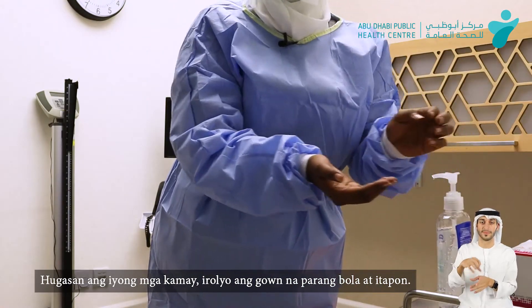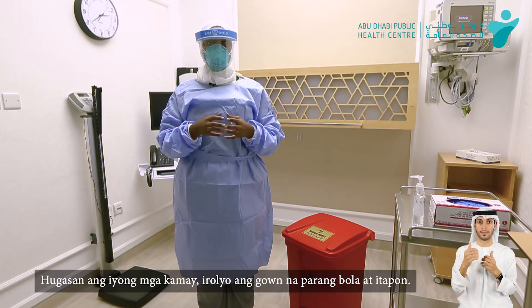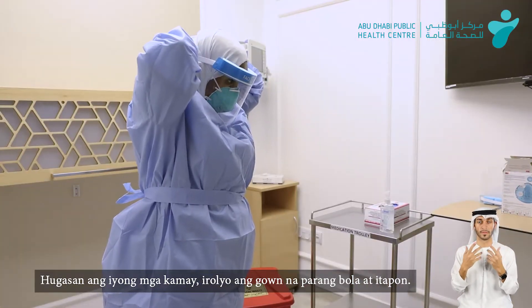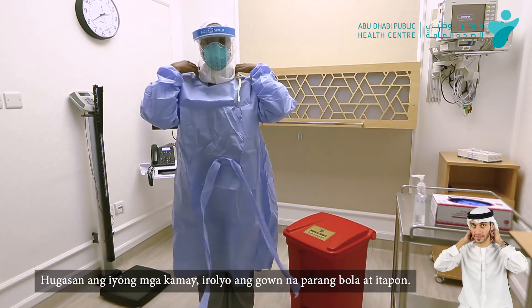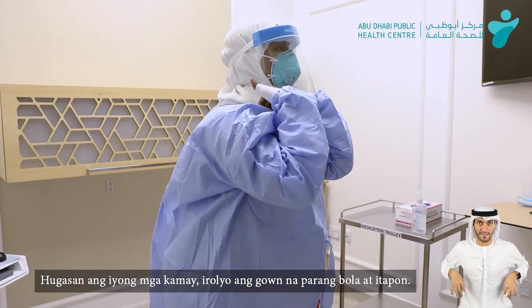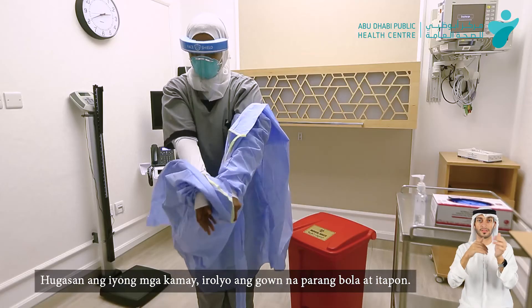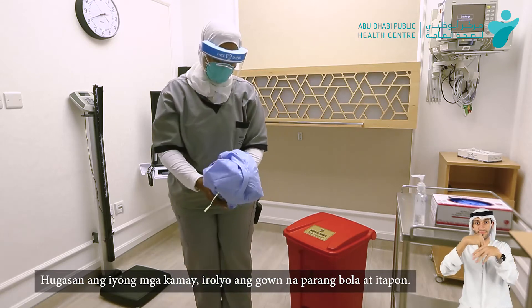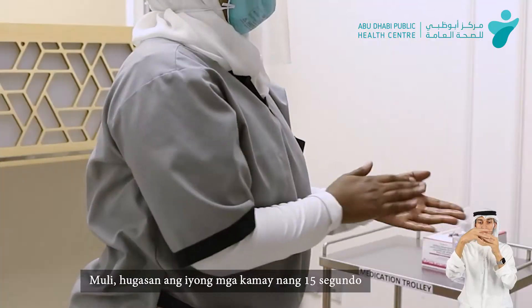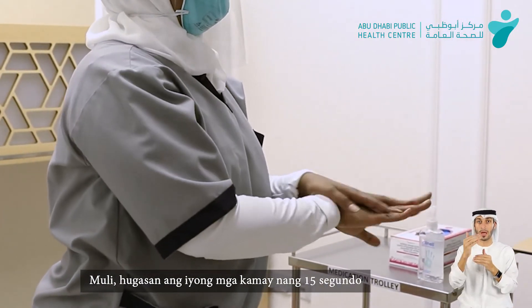Then we'll start by sanitizing. Then we'll start by taking off the gown — we'll remove the strap from the back. We'll start removing, touching only the inner side of the back, making a ball and then disposing. We can again do hand hygiene.